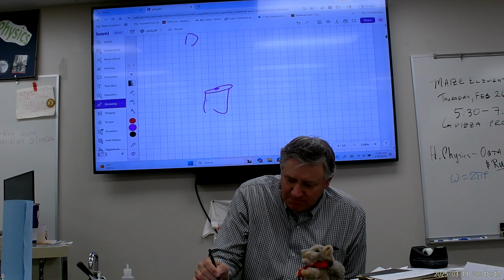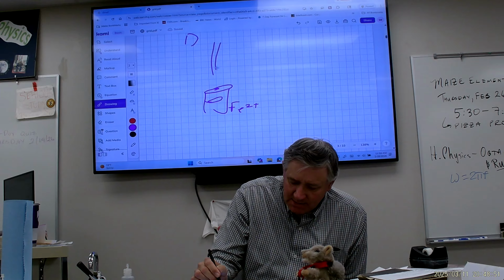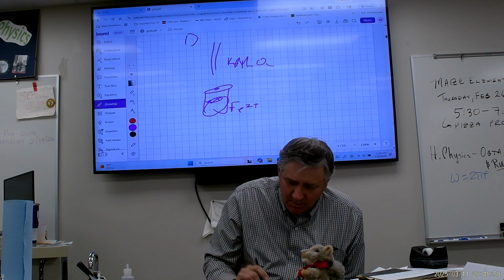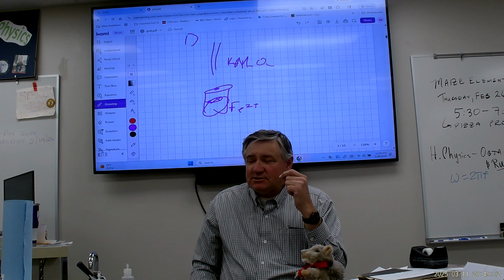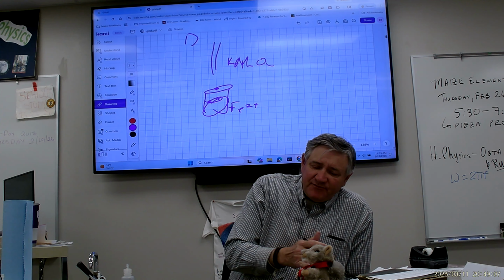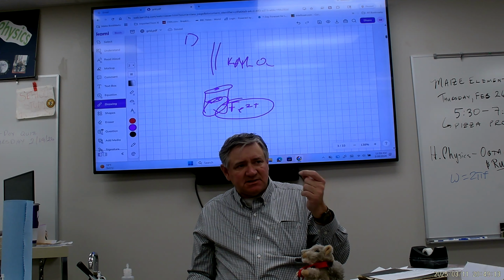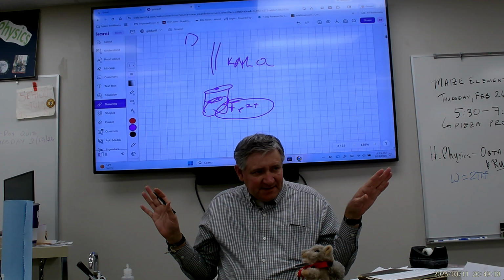You had Fe2+ ions in here, and you added the KMnO4 to it, okay? And then, again, this was not a color change, okay? Did you stop it when it turned magenta? Yes, but it wasn't a shift from being acidic to basic. All this was that as long as there were Fe2+ ions to react with it, the MnO4 faded out.